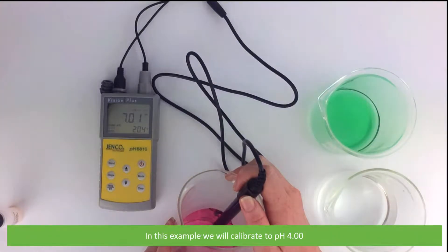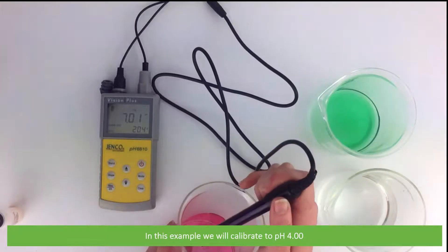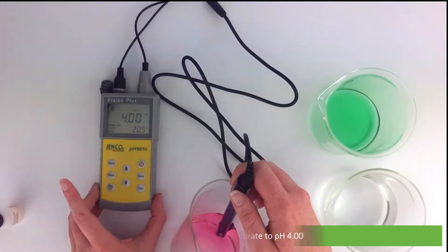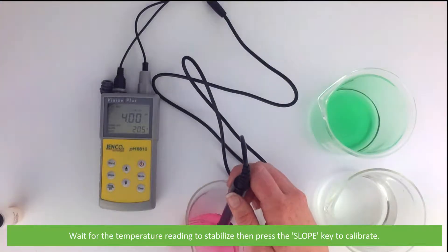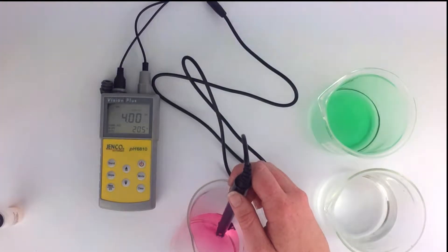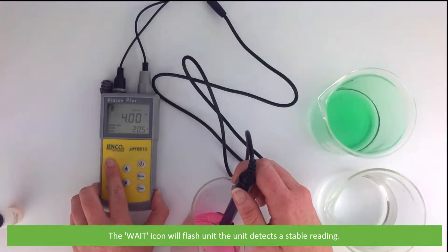In this example, we will be calibrating the second buffer to pH 4.00. Wait for the temperature reading to stabilize, then press the slope key to calibrate. The wait icon will flash until the unit detects a stable reading.